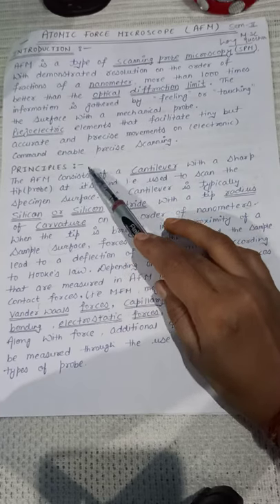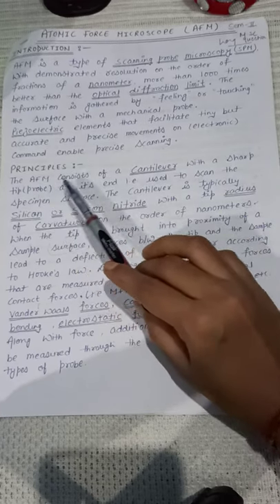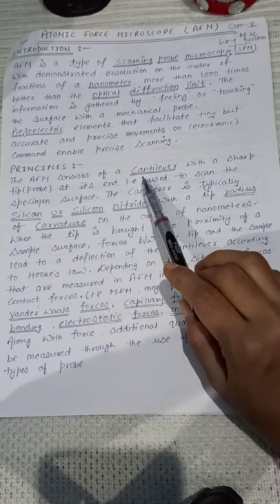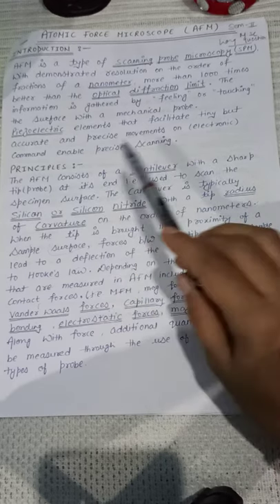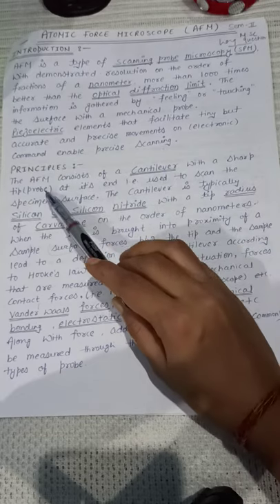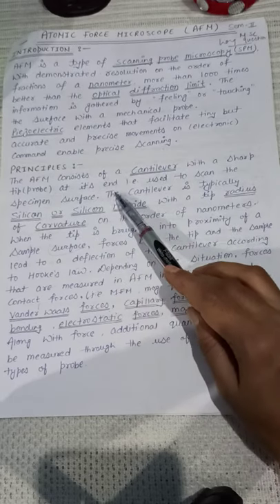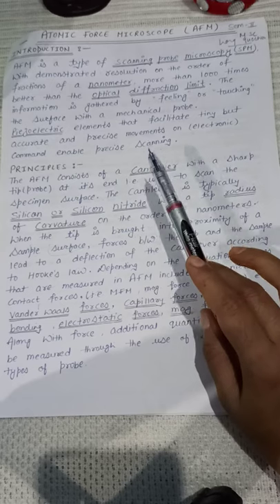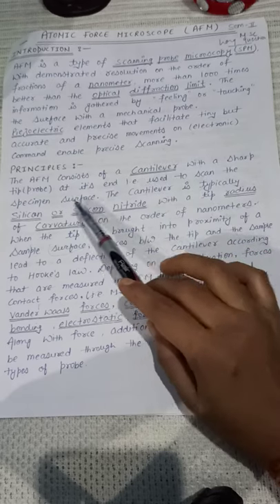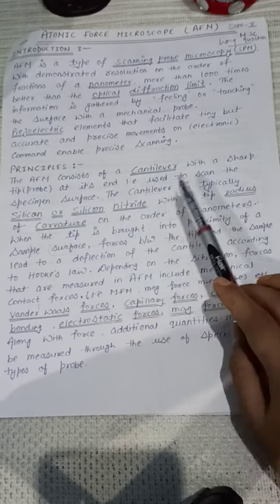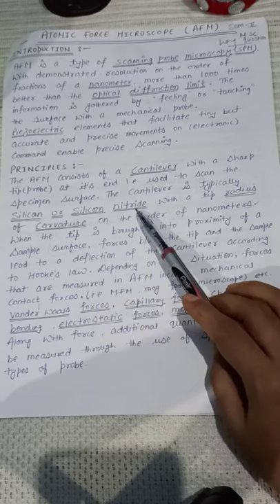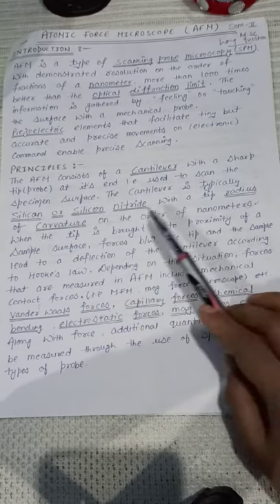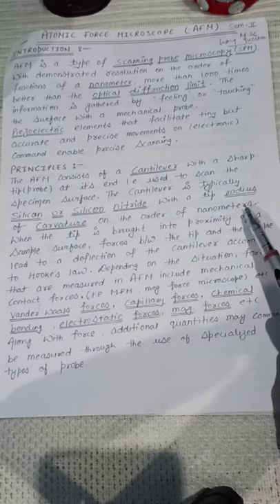Now come to the principle. The AFM consists of a cantilever with a sharp tip, also called probe at its end, and it is used to scan the specimen surface. The cantilever is typically silicon or silicon nitride with a tip radius of curvature on the order of nanometers.